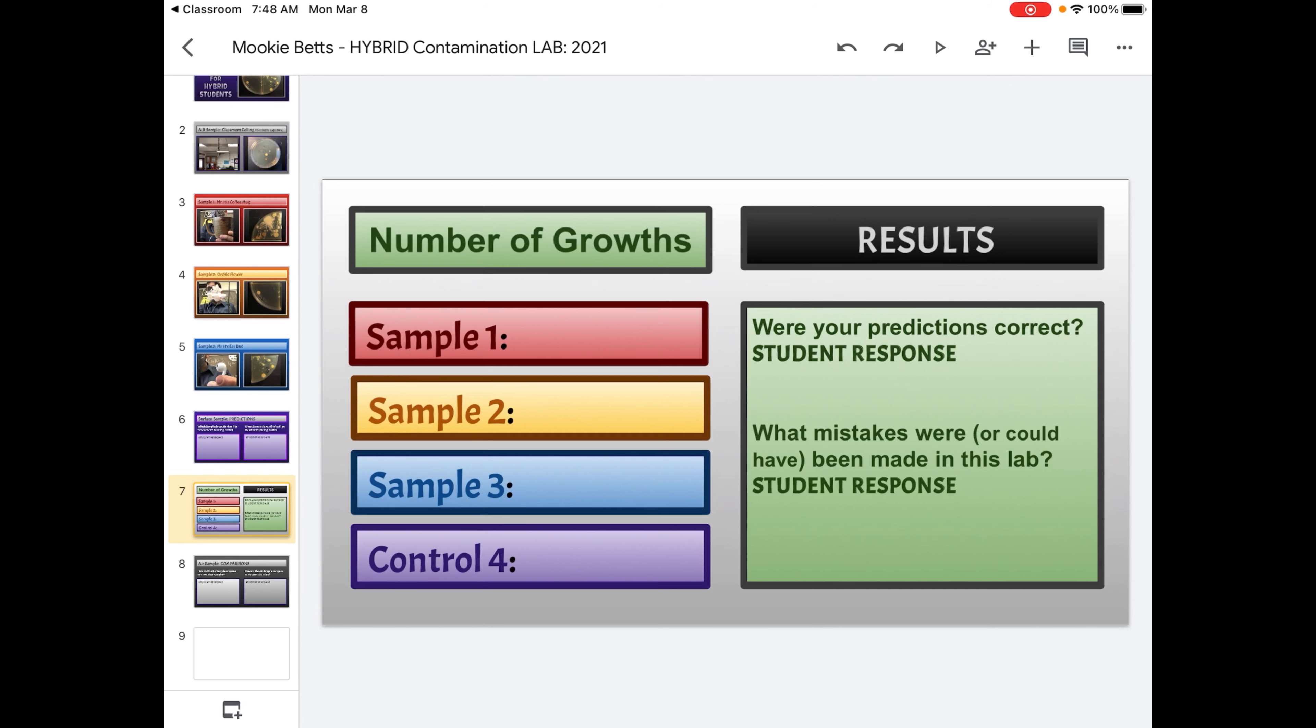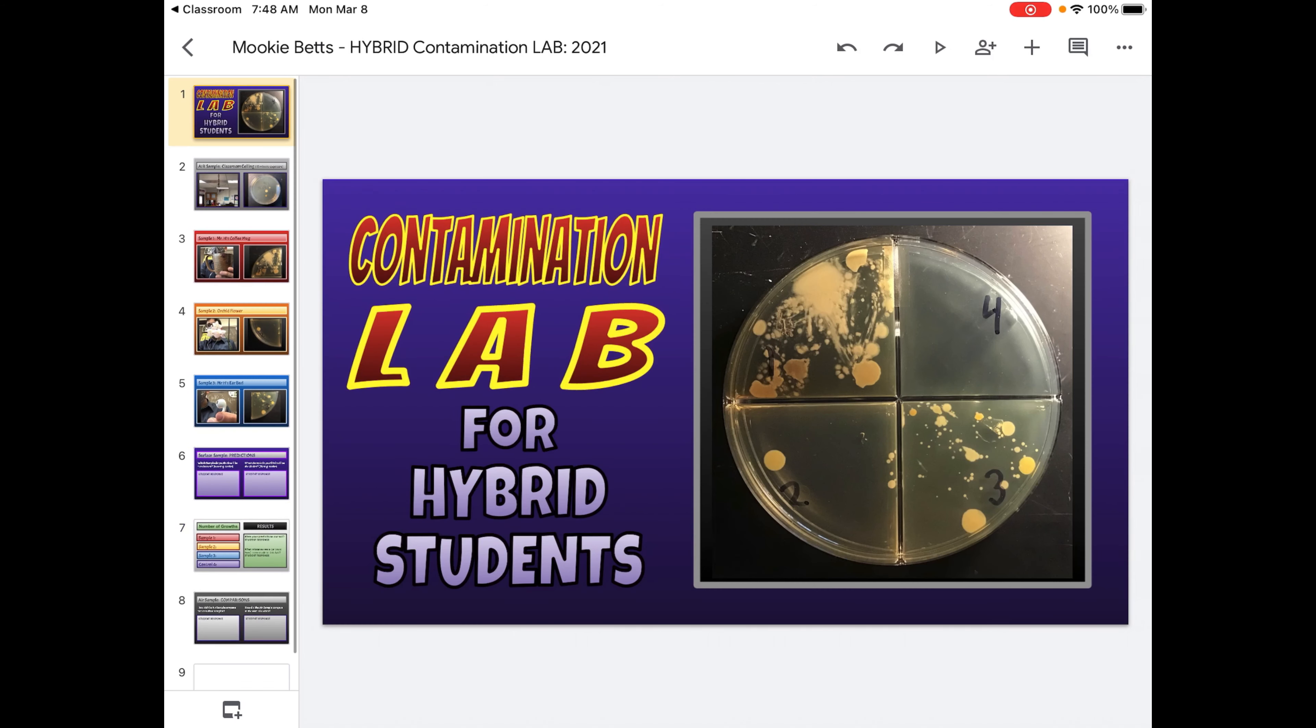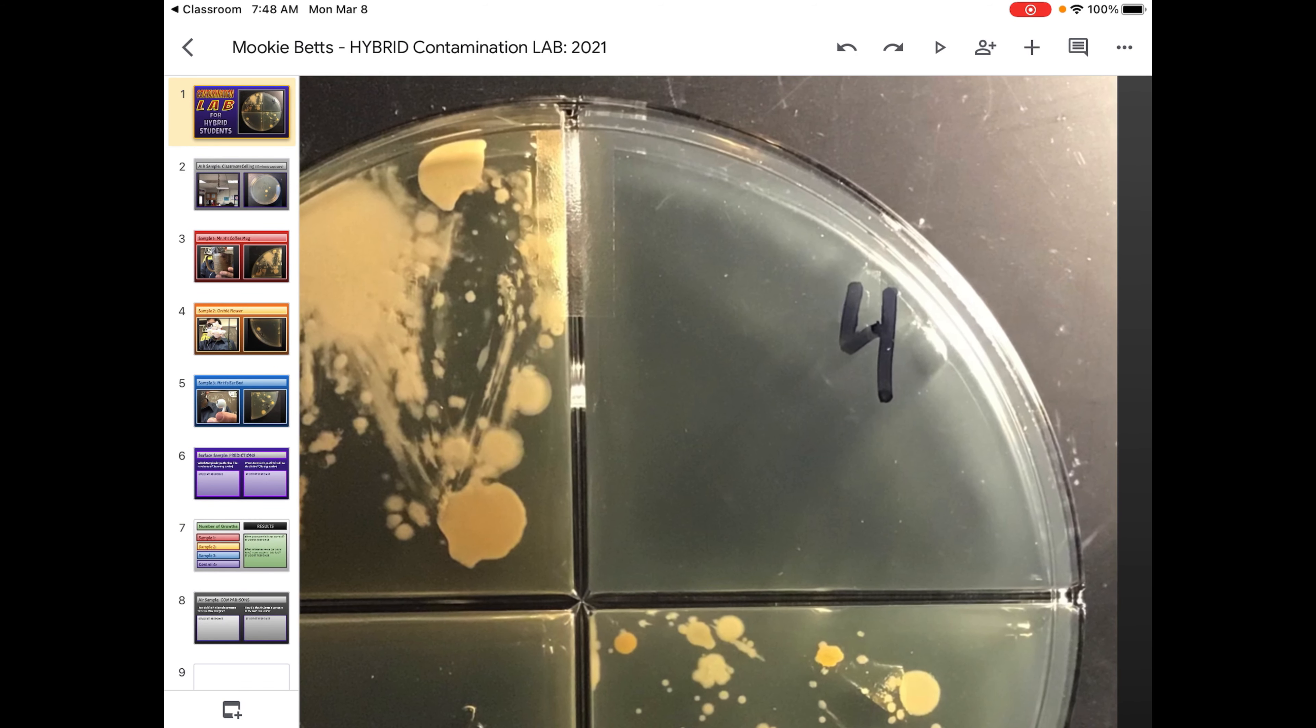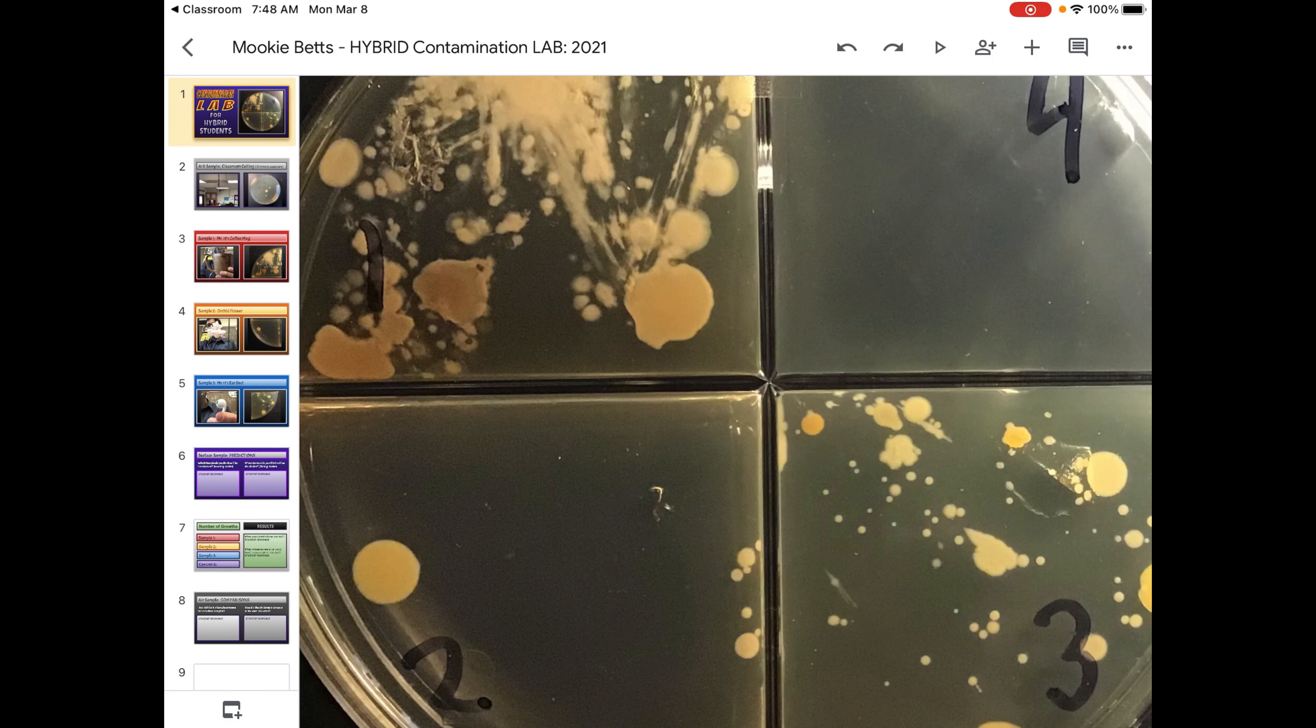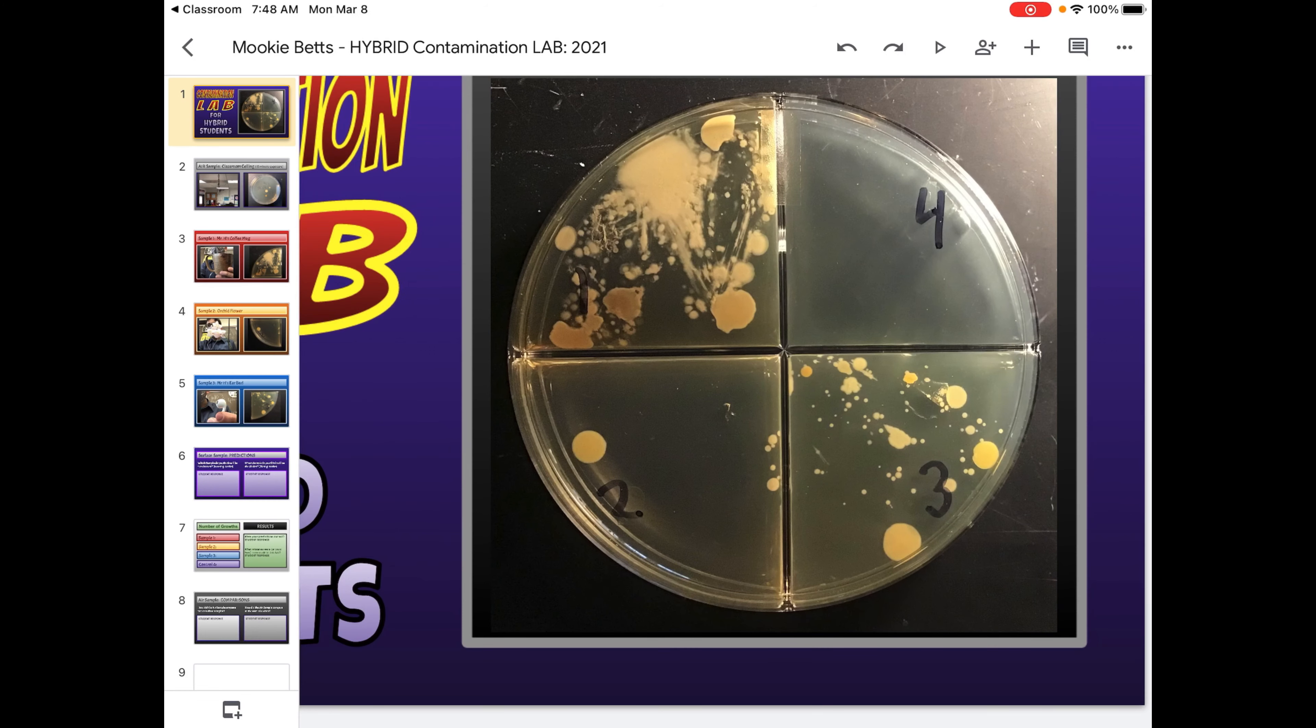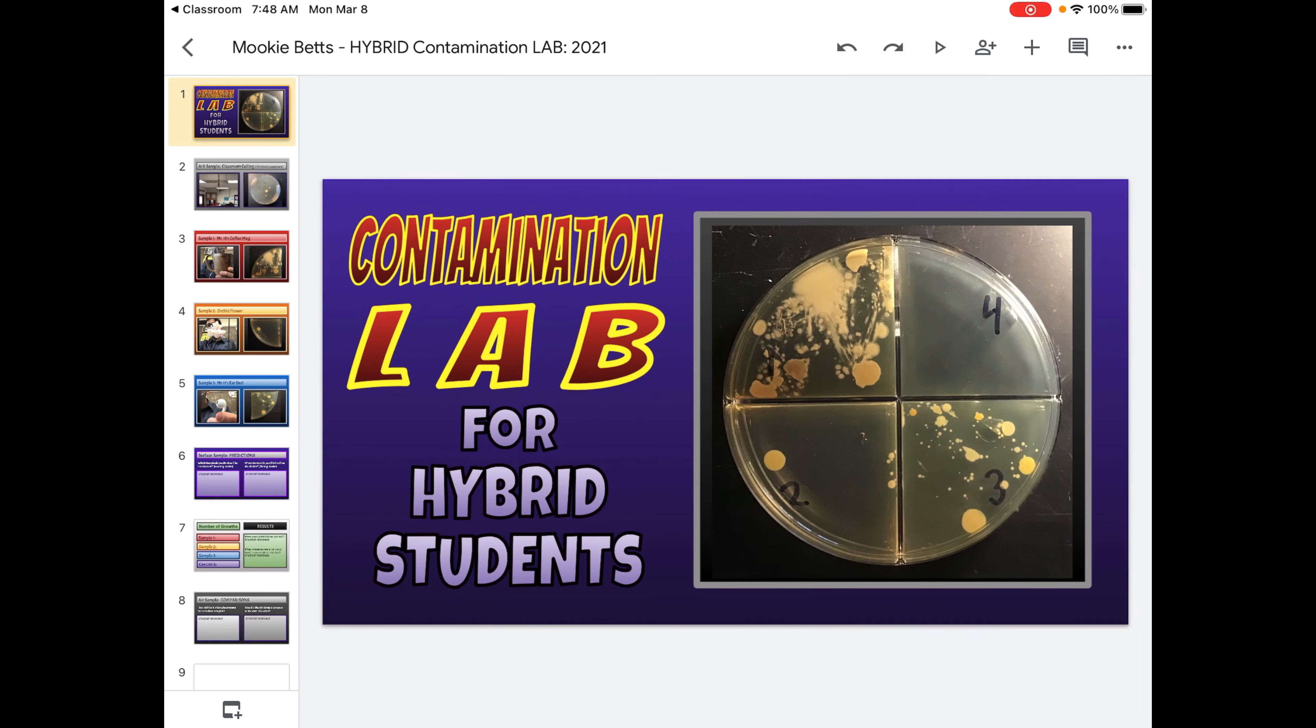So what mistakes could have been made? That's pretty easy. For instance, in your control, if in your control you have growth, why do you have growth? Did you leave it open too long to the air? Did somebody swab in the wrong section? If in sections one, two or three, nothing is growing, that was probably some kind of mistake. Sometimes people put their swab on the lid instead of the agar and nothing grows on the lid. So we're going to see some mistakes.